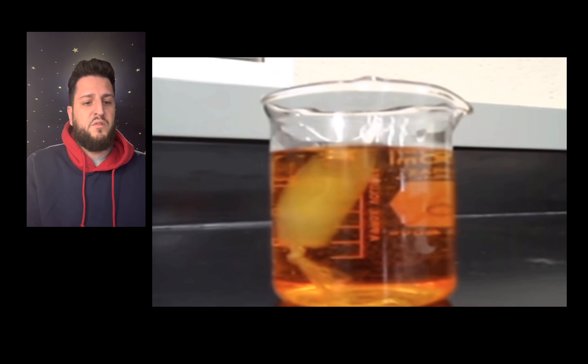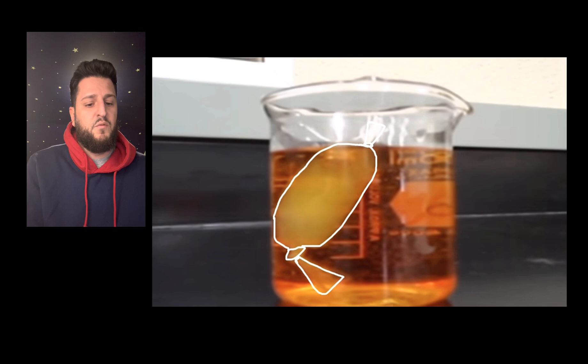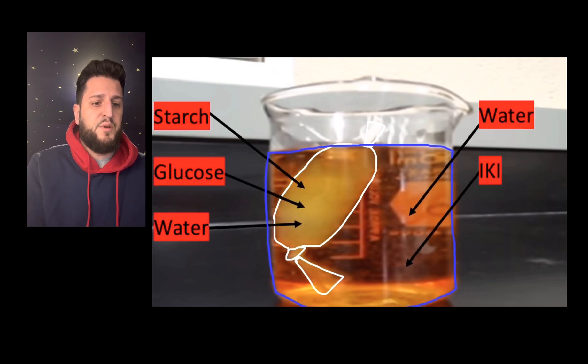Once you start watching the video, you'll notice there is a bag of dialysis tubing within the beaker of water. The dialysis tubing is kind of a whitish yellowish color and is sealed off on both ends. Inside the dialysis tubing, we have three things: starch, glucose, and some water to dissolve the starch and glucose inside the dialysis tubing.